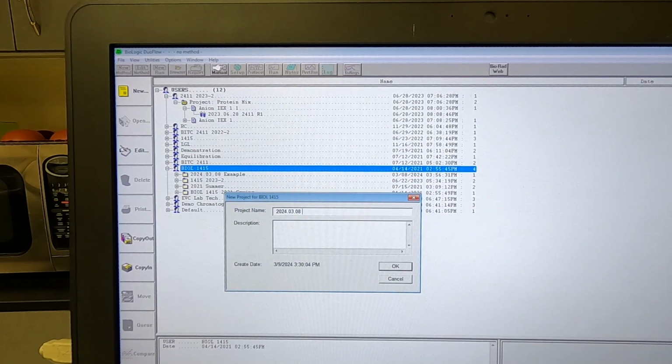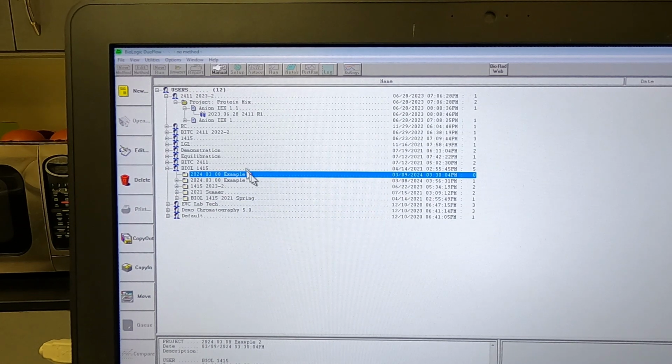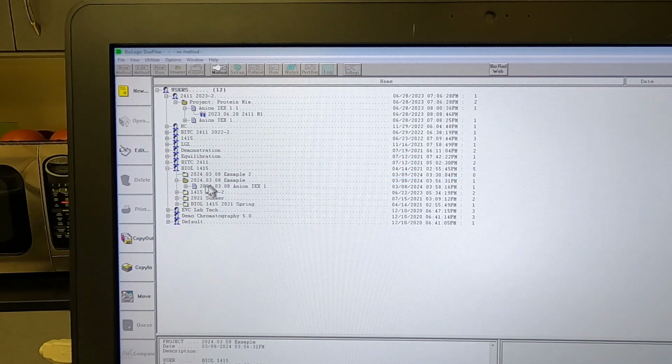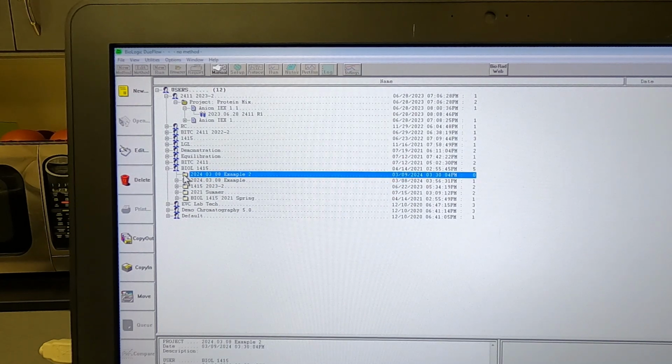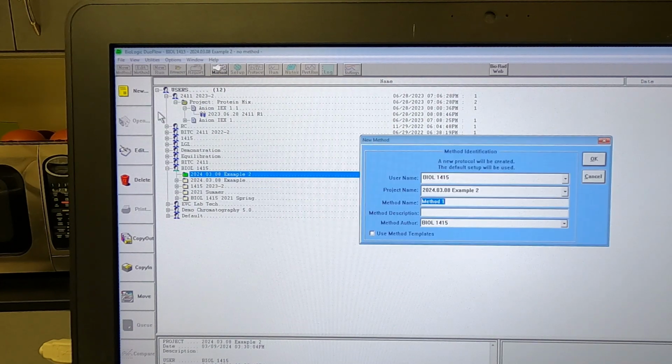So I usually try to put that at the beginning, and then I will name this example 2, because I already have one example. Alright, so you can see now we have a new folder, but we don't have the plus arrow because we don't have any methods, like this one does. So we're going to right click on our project folder, or you can go here to new, do new method. I'll name it the method type. So we're doing anion exchange, and IEX is shorthand for ion exchange.